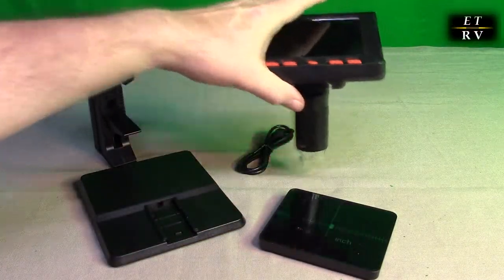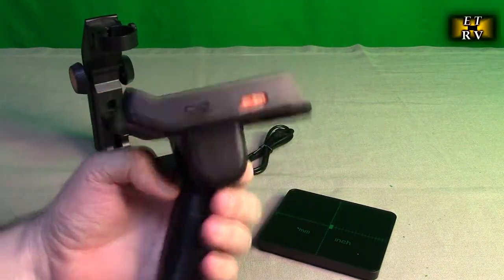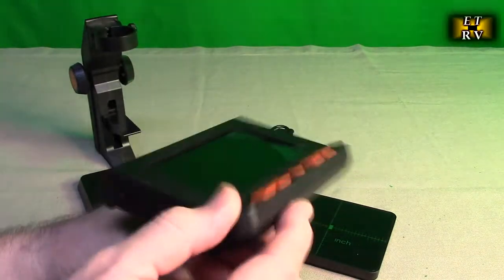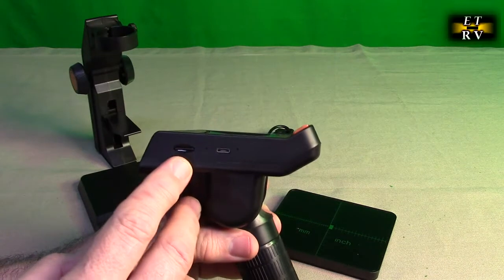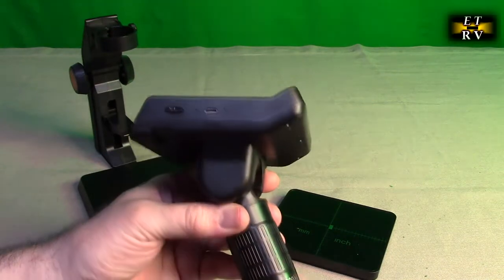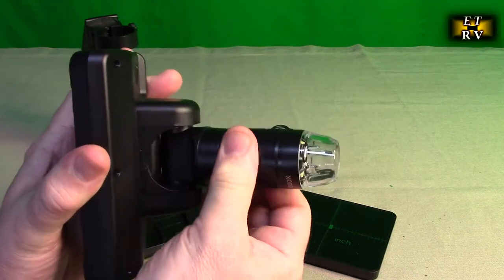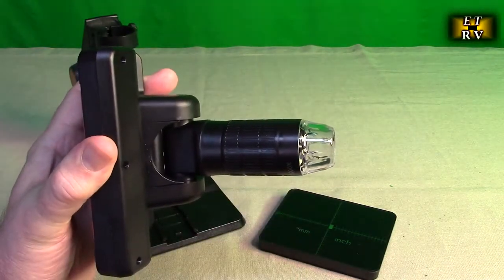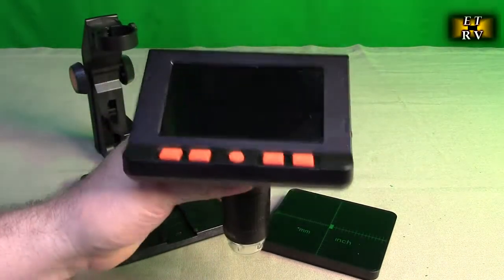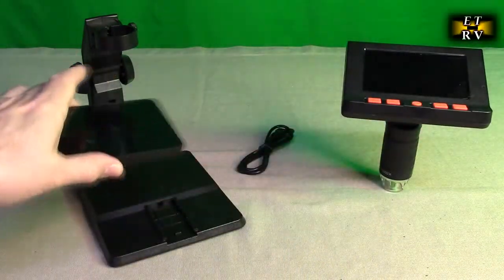What's really unique is that on this unit itself, not only does it have the LED array right there with a brightness control, there's your power switch, and here's all your control buttons. On the side you have your TF card slot and your micro USB port to charge it. Right on here there is a focus wheel — that's what's going to allow you to zoom in and out to get the final focus. The raw focus is going to be with this platter moving up and down.